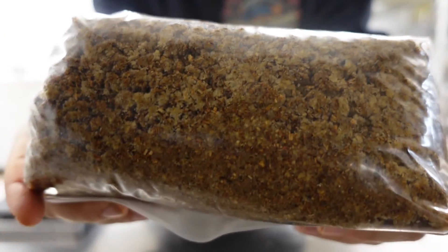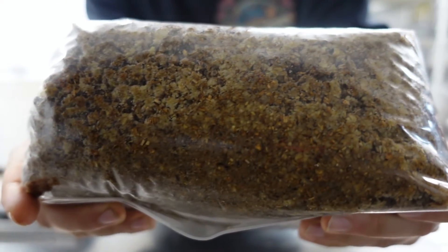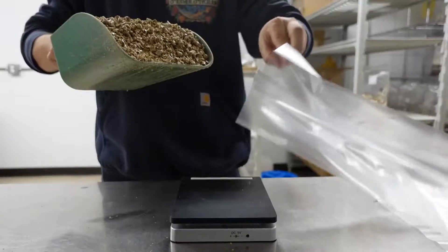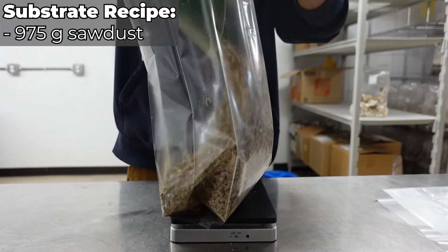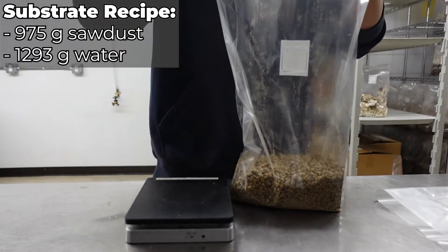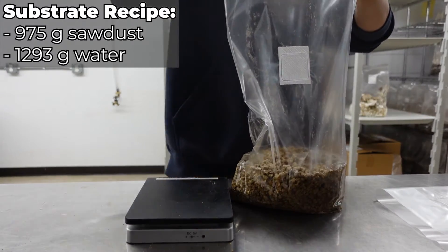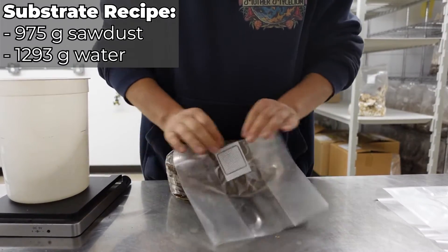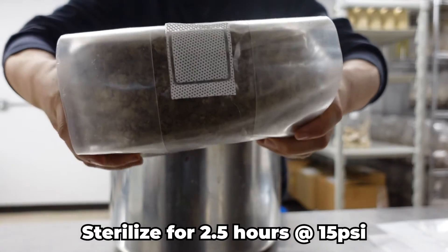Now it's time to prepare the hardwood substrate, which will give our mycelium a substantial food source that will allow it to produce a healthy yield of mushrooms. Start by adding 975 grams of hardwood sawdust to your filter patch bag, followed by 1,293 grams or milliliters of water. Now fold up your bags nice and flat and pack them neatly into a large pressure cooker and sterilize them for 2.5 hours at 15 psi.